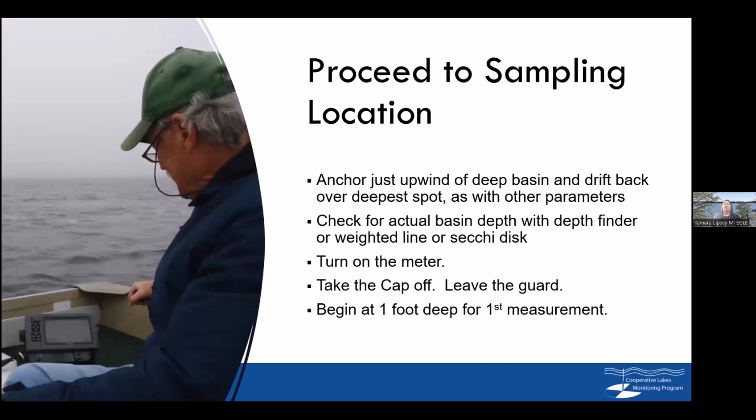There is also a how-to-replace-your-membrane video online, but for the sake of time, I don't think I included it here. But there is a video online on how to change your membrane.